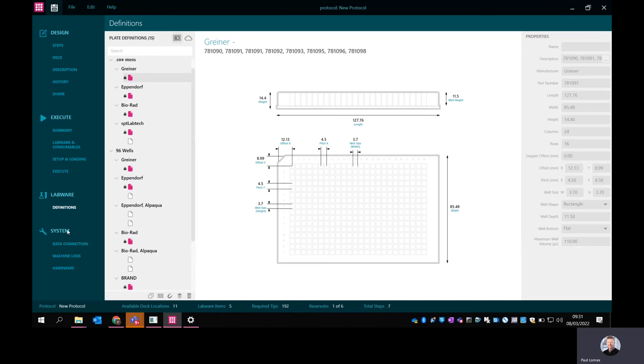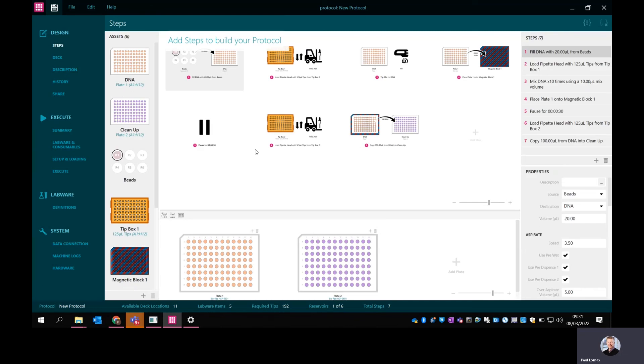The final part I'm not going to go into is really just system control level for our service personnel and also certain elements that are accessible to customers. But that's really more applicable when there's a machine connected. So there you go. That's just a very short overview of the Firefly software. Please do contact us if you have any further questions. Thank you.